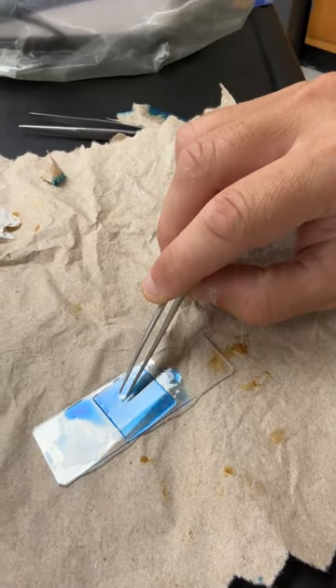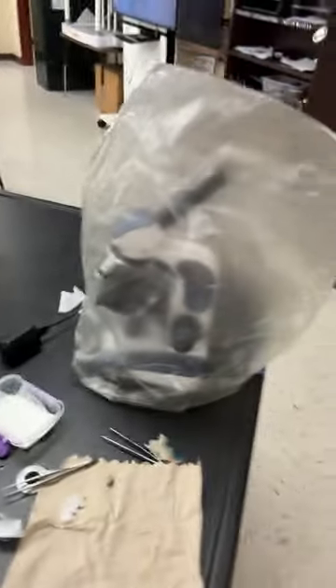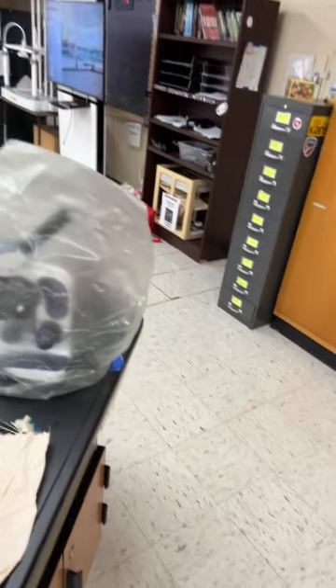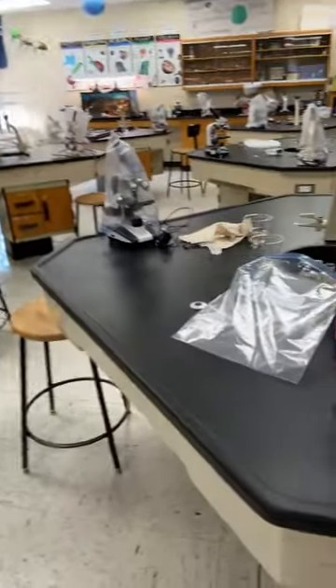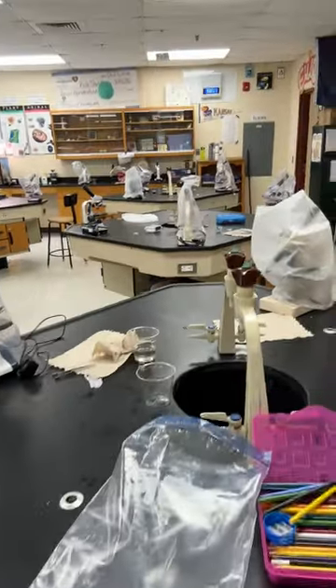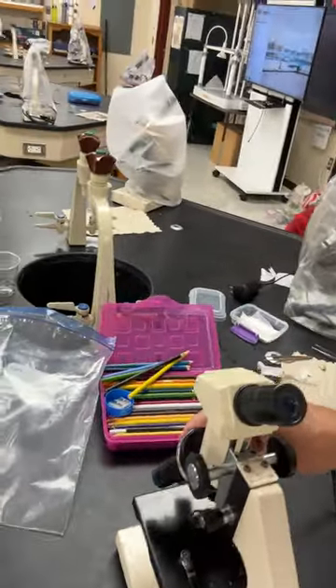There is an air bubble in here. I can try to tap it out, but it's not a big deal — you can move around the air bubbles. When you go to look under the microscope, these cheek cells are a little harder to find; they're smaller than plant cells and scattered throughout. Get your microscope ready to go and always start with the red objective.